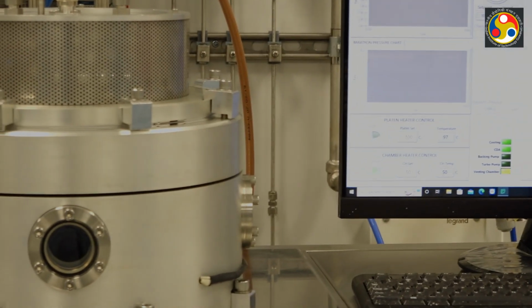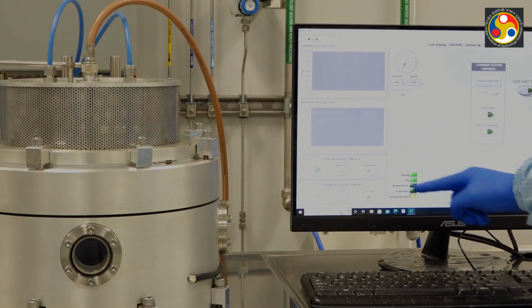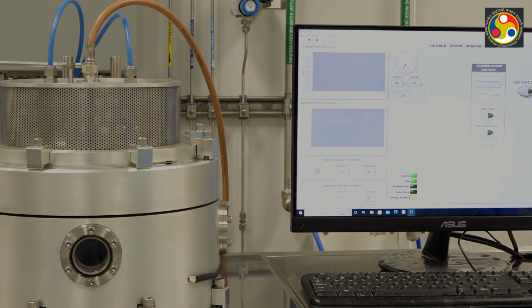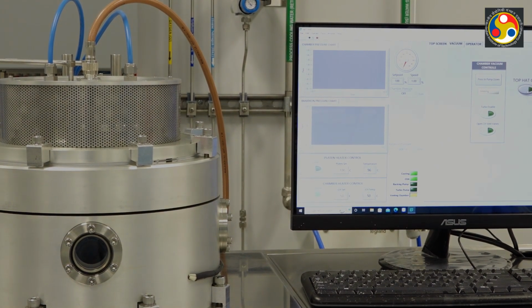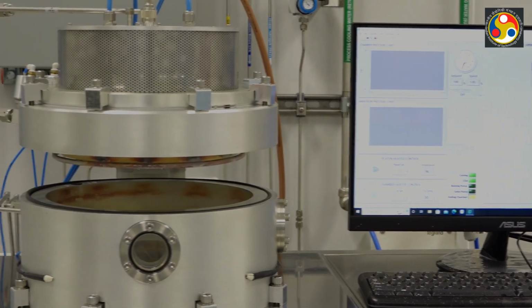Now you can see venting chamber indication is on. The chamber is under the venting, and now I can open the chamber.